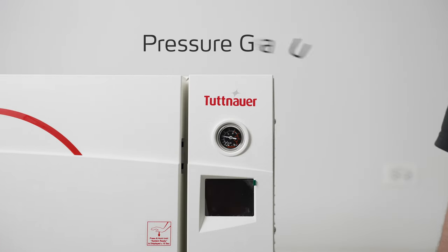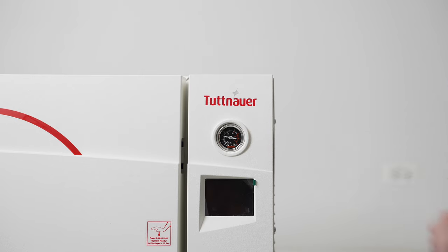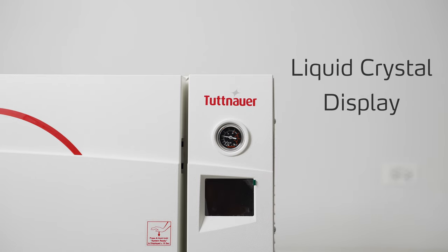First I would like to point out the pressure gauge here. This is a live reading pressure gauge that will show you the actual readings inside the chamber during operation. Below that we have the liquid crystal thin film display — a full color display that will show you the live readings inside the chamber as well.